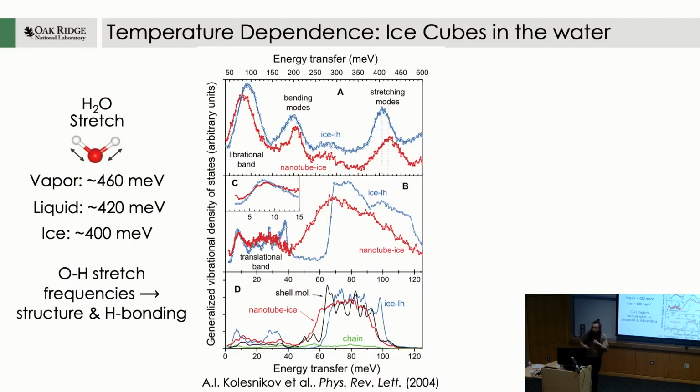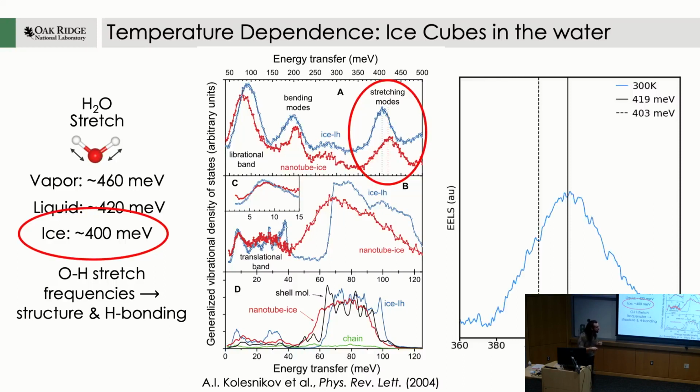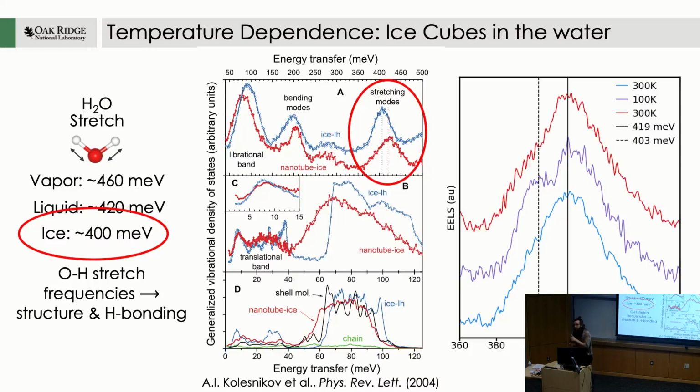And there are other interesting things that happen. We could perform the same experiment on the 420 millielectron volt tubes. And what you can see is that ice has its own unique effect on the OH vibrational mode, and especially bulk ice has a well-known peak at 400 millielectron volts. And when we took the tube vibrating at 420 millielectron volts to cryogenic temperatures, we saw the emergence of this secondary peak at 400. And the nice thing is when we went back to room temperature, we saw that peak go back to normal. So this looked very much like a strong indication of a reversible phase transition.